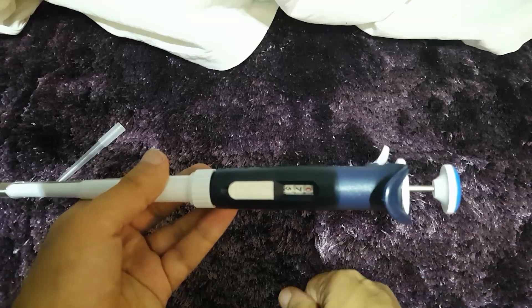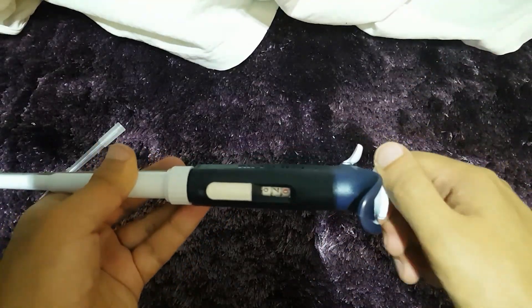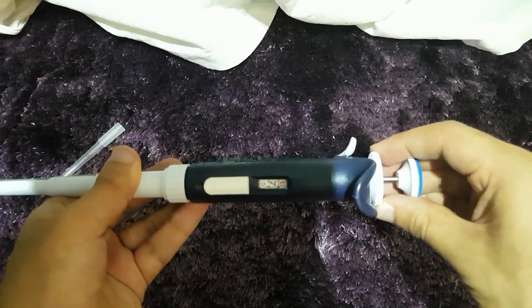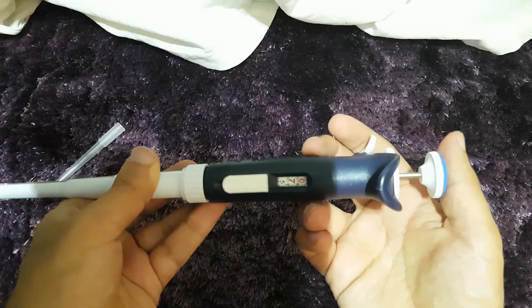Just to recap, I hope you remember how to use a pipette. Pull this up here to adjust the volume — let's say we do 750 microlitres. You push this back down here. Check it works.